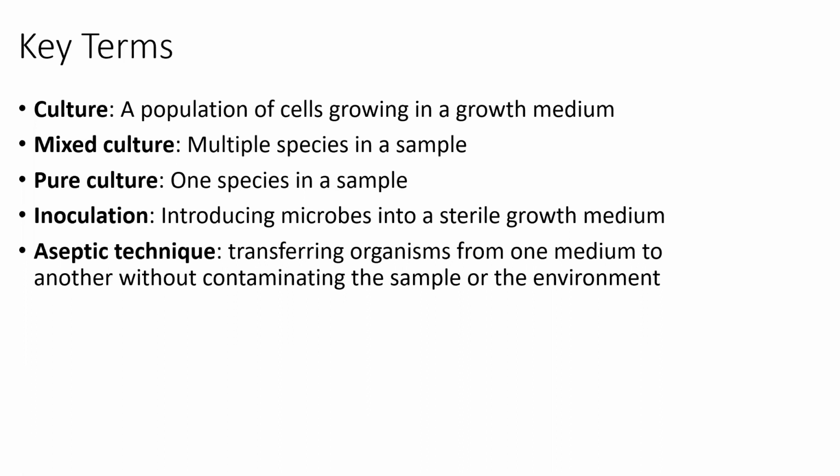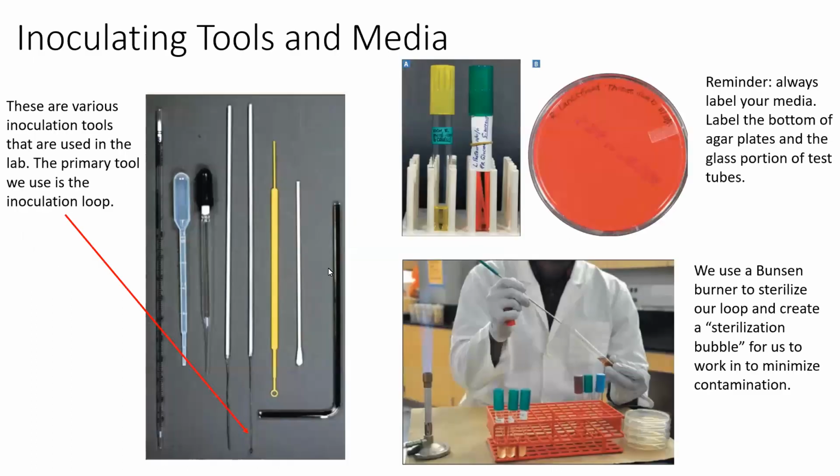Okay, I'll normally say aseptic technique. So let's take a quick look at some of the tools that you will be using in lab and kind of just the normal work setup when you're going to be doing aseptic technique.